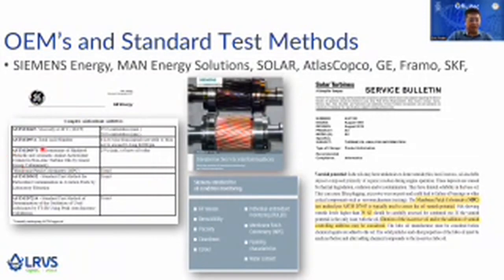They are also including ASTM D6971, linear sweep voltammetry, which is the RULER test, and also the MPC, patch colorimetry, the MPC test. And then for Siemens, they are also including standard testing parameters like viscosity, cleanliness, air release. Of course, RULER and MPC are important to be included.